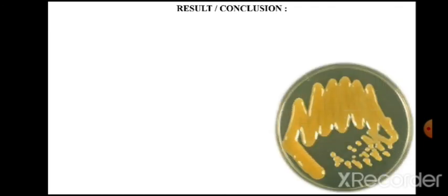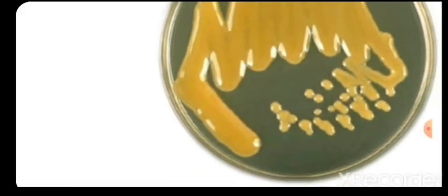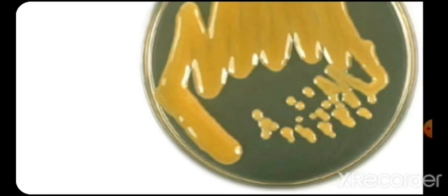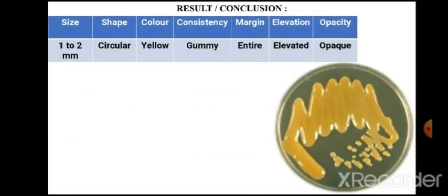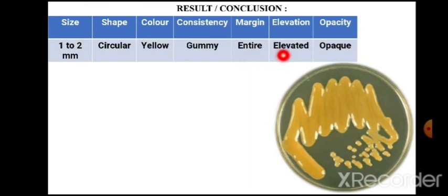The results: the types of colonies are glossy, gummy, and big colonies with yellow color. Record the colony characteristics — these colonies are big, as large as 1–2 mm, circular in shape, yellow colored, gummy or sticky, with entire margins, elevated and cupoid.